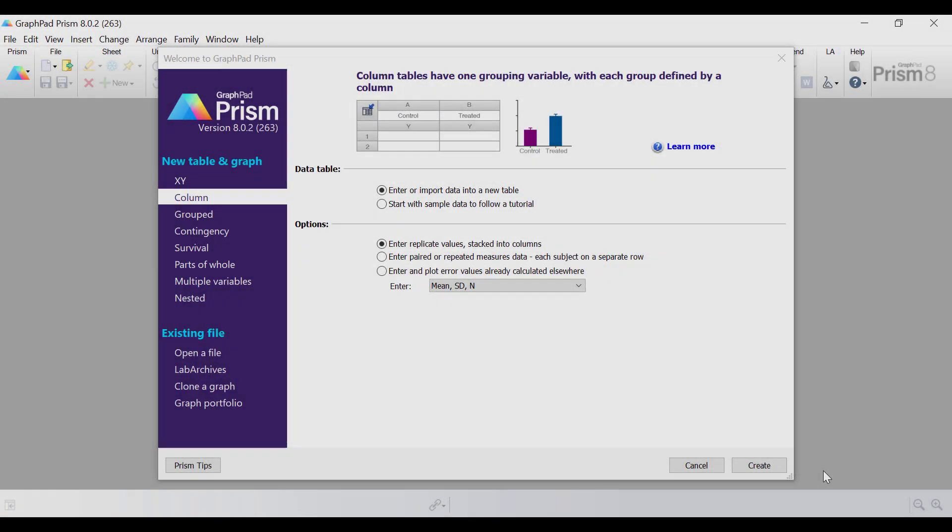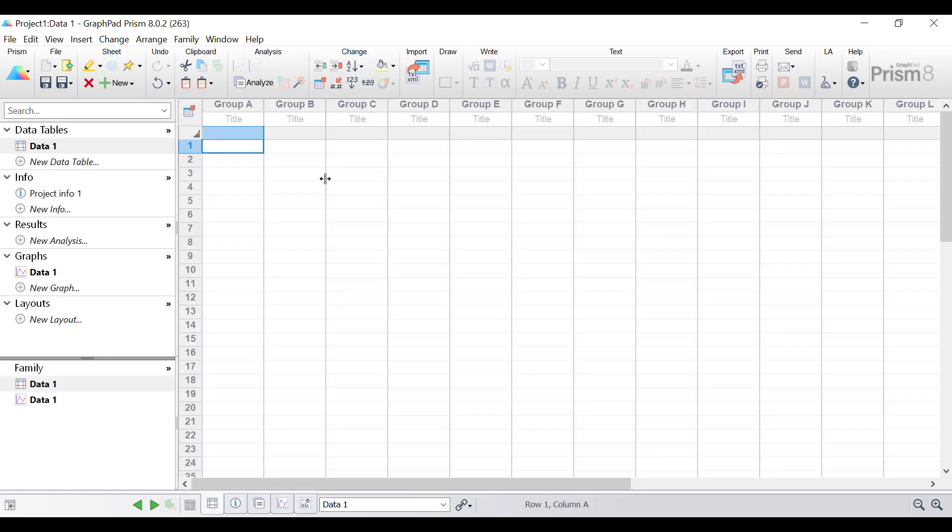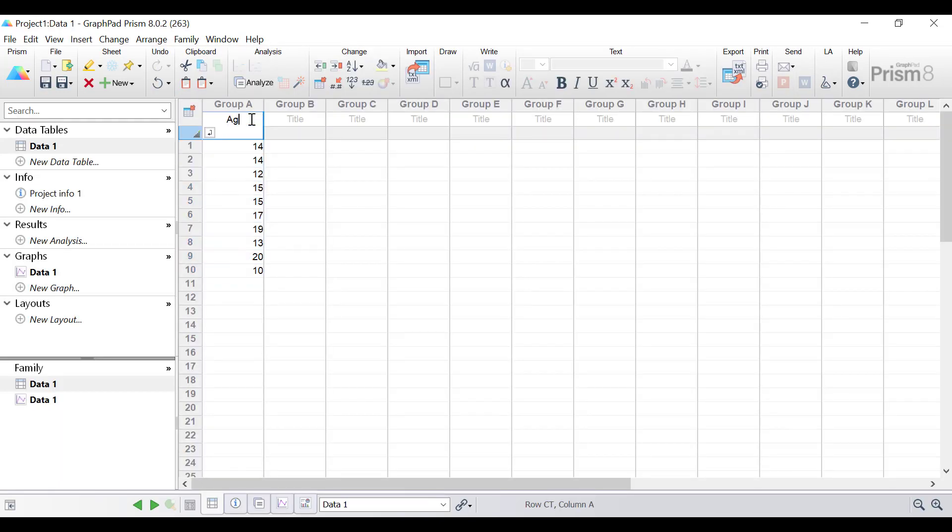In this example I'll start by entering data into a column data sheet. I'm going to click create and paste in some data as an example and call these ages for participant ages.